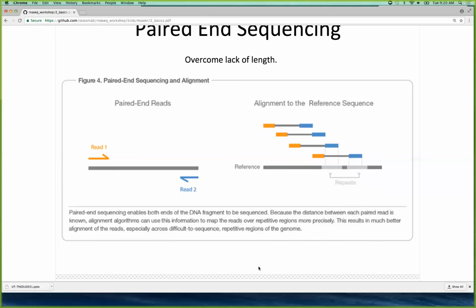Yeah, so if you do just a mechanical shear and then run it out on a gel, it should be pretty random. We see some sequencing bias toward one end of the gene. I think you get a little bit more sequencing depth at the 3' end, but it kind of washes out in the statistics because it's consistent across all your samples.